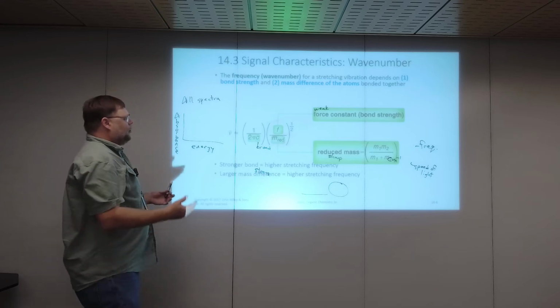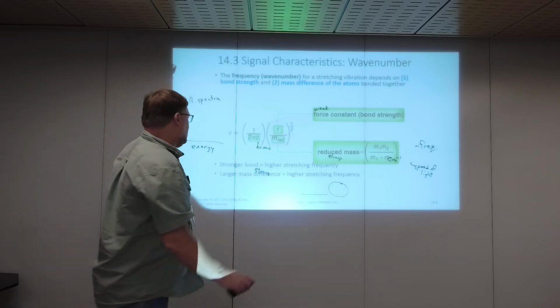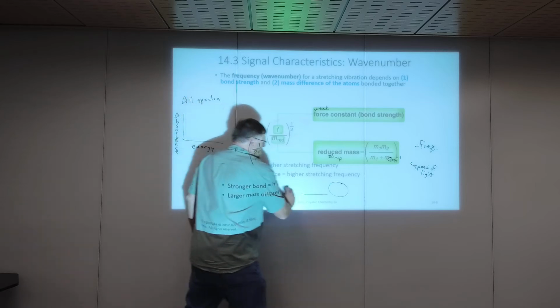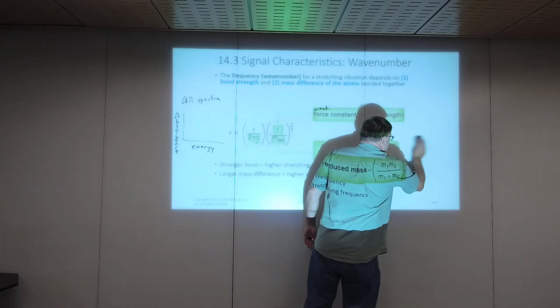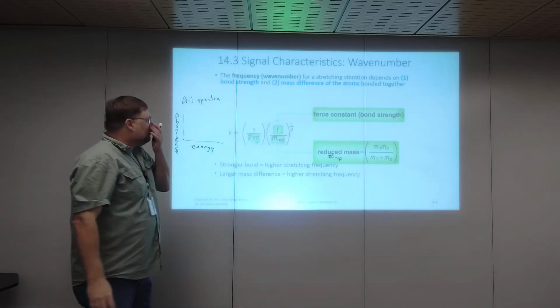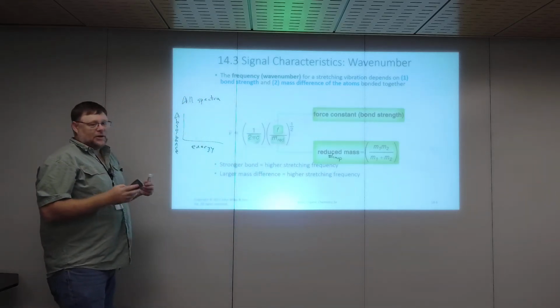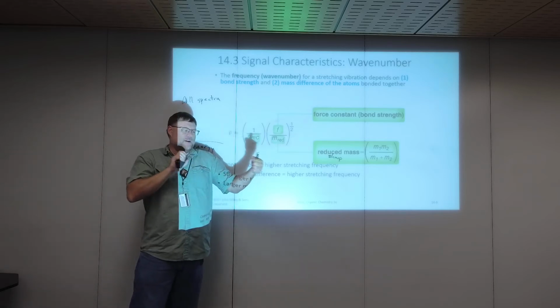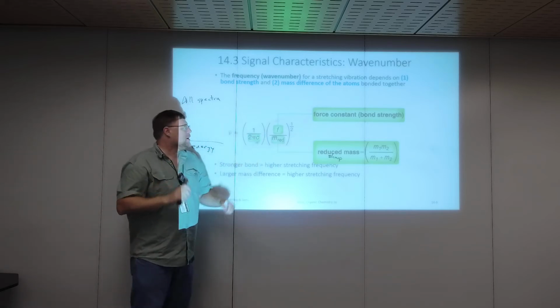And here's some math that you don't really need to get into. I'm not going to ask you to solve these equations. This is just sort of explaining some of it. All right, so the frequency for a stretching vibration is going to depend on how strong the bond is. Again, it's a stretching vibration. Put a stronger spring in there, it takes more energy to make it stretch.